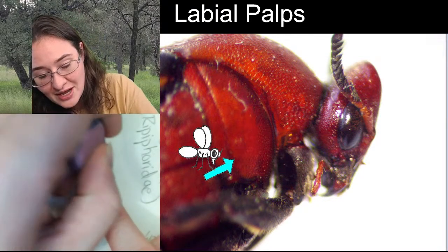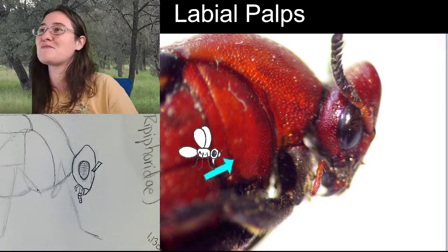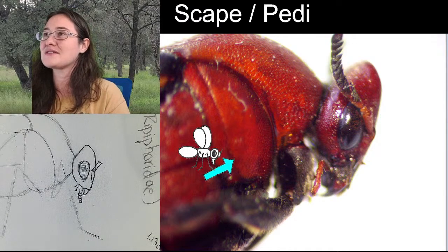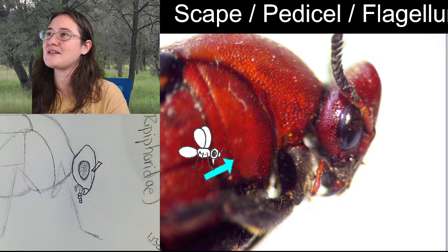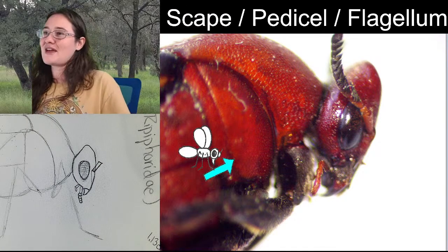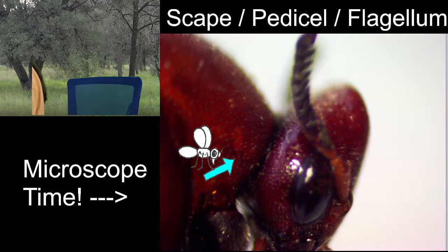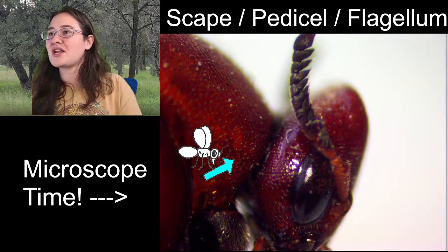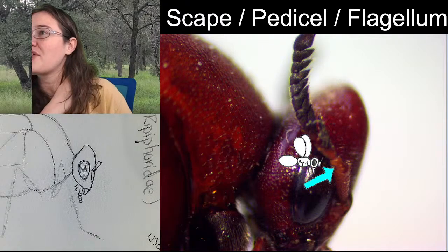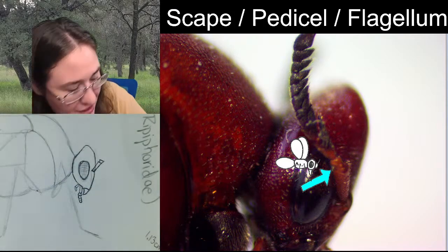All right, so somebody had mentioned earlier they were happy that the beetle had color-coded our antennal pieces for us. And so, just so that everyone has the spelling of all these body parts I'm about to share with you, the scape, the pedicel, and the flagellum are all segments on the antenna. Now, the scape is that first segment that is nice and long and orange and is the connection of the antenna to the head. The second segment down there, that's that really little itty-bitty triangle here, that is the pedicel. It's also orange on our beetle friend here.